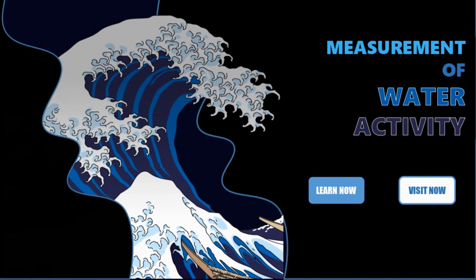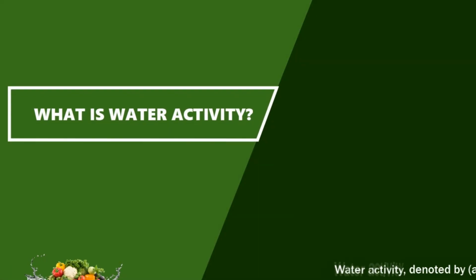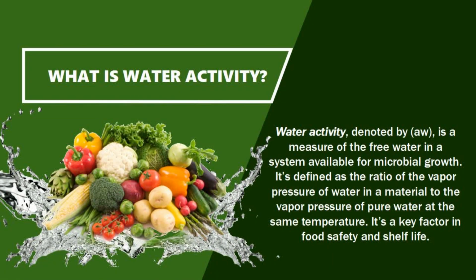In this video, I'm going to discuss the measurements of water activity. But first, what is water activity? Water activity, denoted by aw, is a measure of the free water in a system available for microbial growth. It's defined as the ratio of the vapor pressure of the water in a material to the vapor pressure of pure water at the same temperature. It's a key factor in food safety and shelf life.